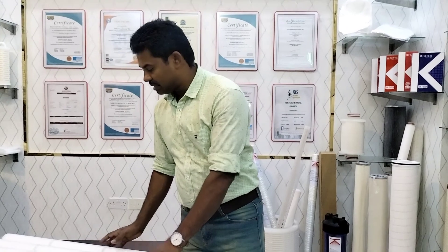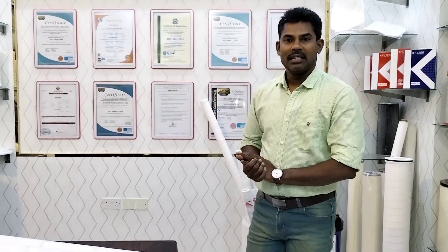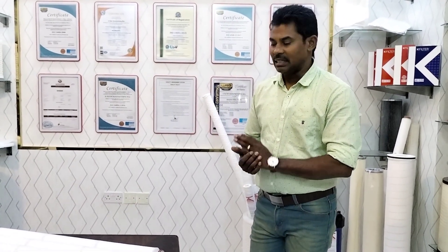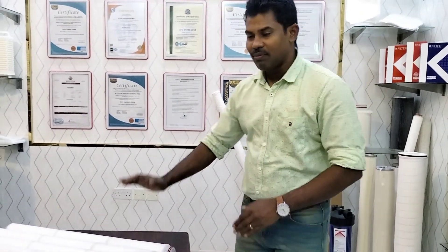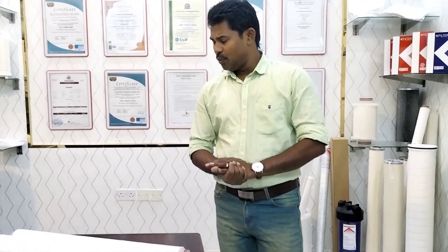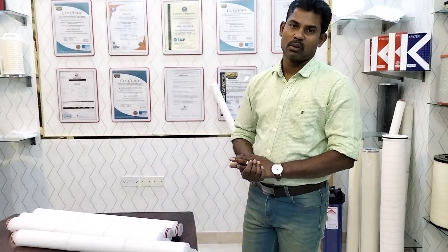These are deep filtration cartridges for applications including pure water, chemicals, lab, petrochemicals, and oil and gas industries. All our filter media use FDA-certified raw materials, especially for food grade applications.